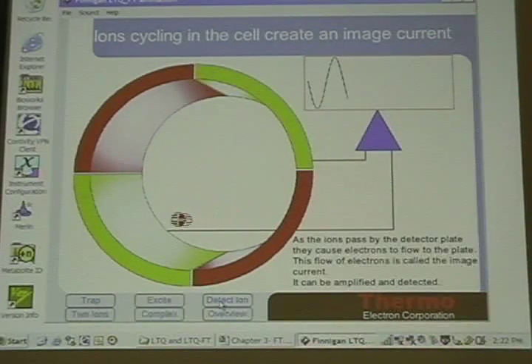How fast are things traveling around? Oh, the flight times. From when the first peptides come to the packet width, the packet width is only 100 microseconds, maybe. It's small. It's not like the packet streams. It's just that sometimes when you have a very small amount, you have to trap them for a real long time.